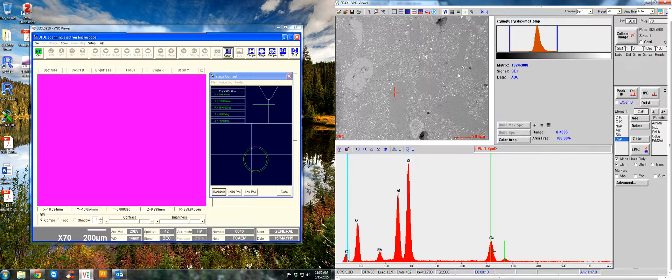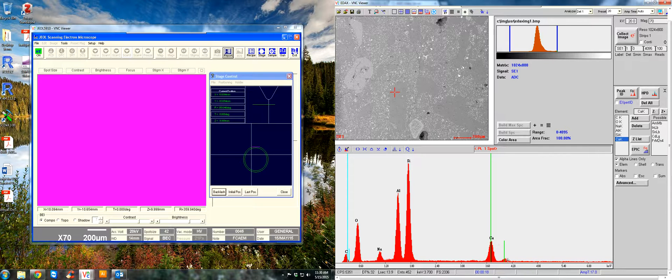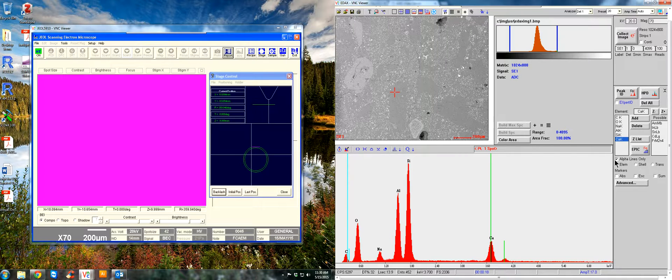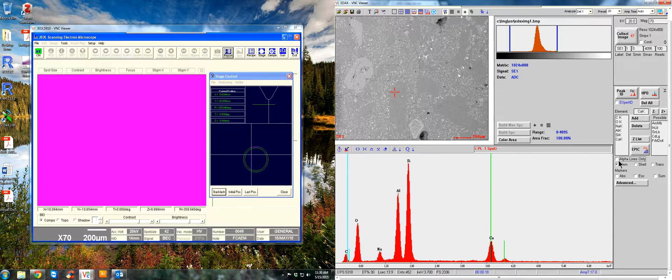This right here, calcium, has two energy lines. This is K-alpha peak and this is its K-beta peak. And that's why you see that little peak down here right next to it. You can choose to show the K-beta peaks as well by unclicking alpha lines only and then clicking on shell.